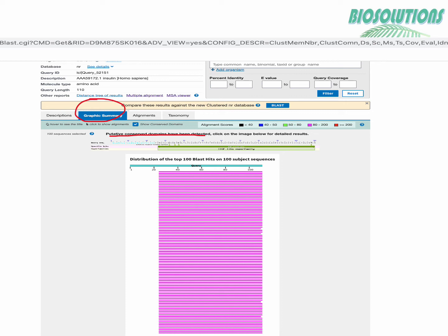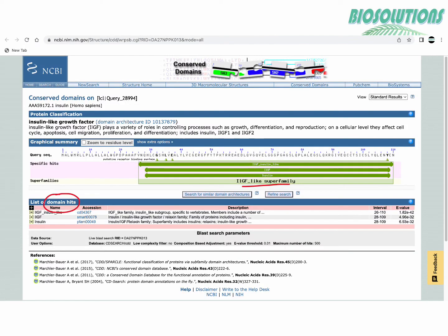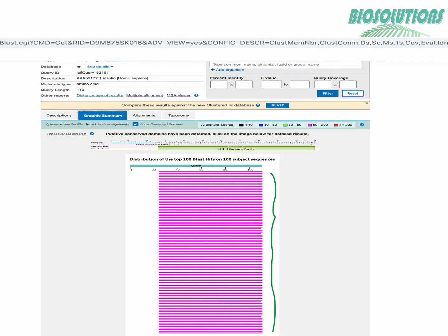By clicking on the image below for detailed result we see this picture showing IIGF insulin like or IIGF domain in members of IIGF superfamily. The green arrow here indicates the span of domain in insulin sequence. So insulin which we have chosen as a query sequence belongs to this superfamily.